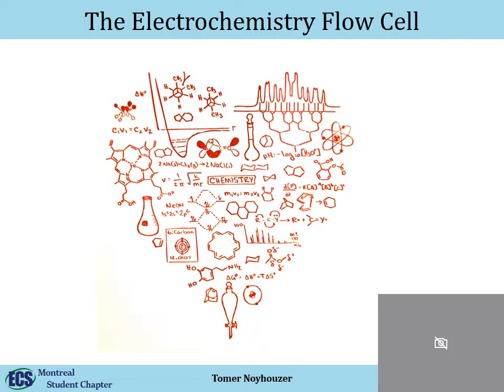Okay, so we talked about the pump, and now we're going to get to the second component, the electrochemistry flow cell, and that's actually the heart of the measurement. That's the most important part, because the pump sometimes will not make a big difference. If you're using a pump from company A or B, once you program it and once you checked it, you're just going to use it. It's just a tool, right?